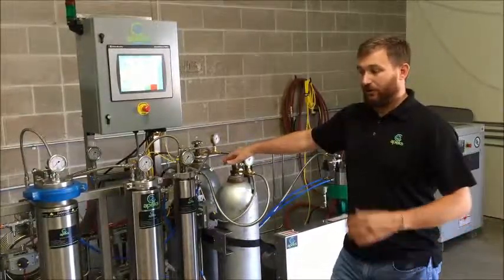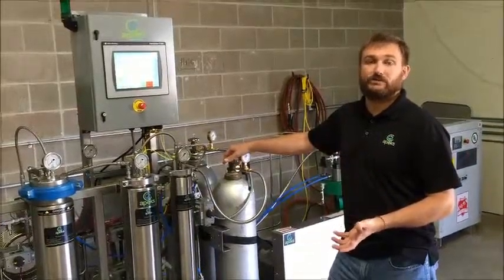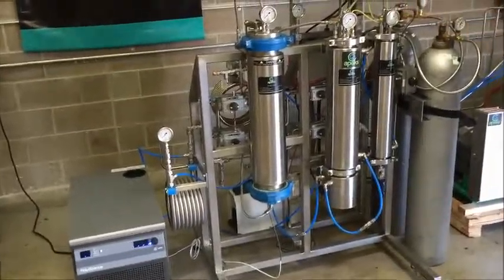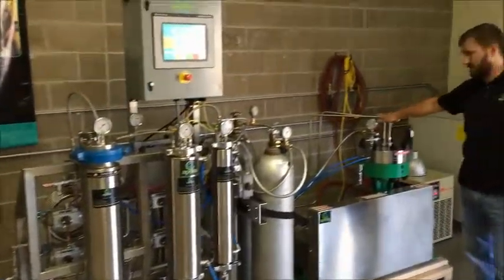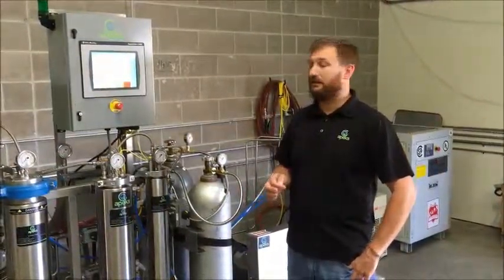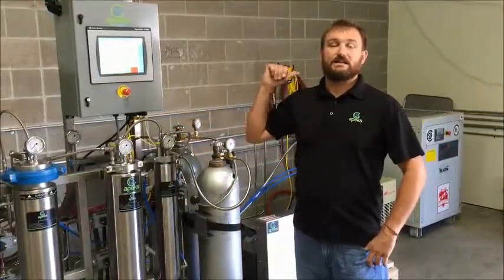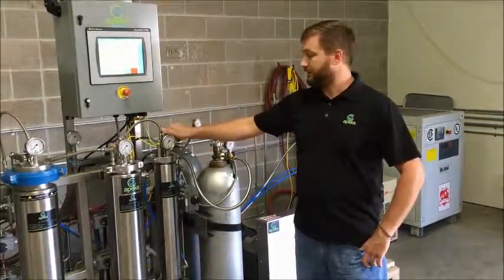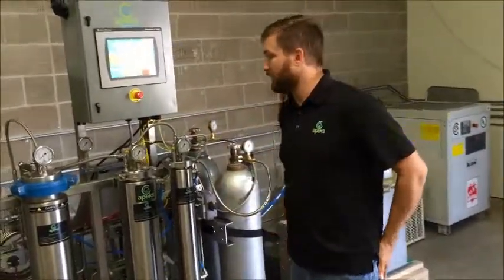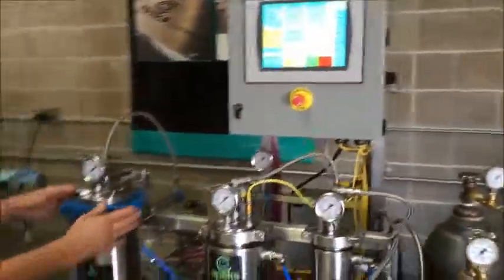Our 1,500 PSI 1-liter desktop system is all 110 single-phase electricity. Our 2,000 series systems have an option between single or three-phase electricity. If you choose the single-phase route, you have a 220-volt chiller, 110-volt system, and a 220-volt single-phase compressor. Our 5,000 PSI series are all three-phase — they require a 220-volt chiller, 110-volt system, and three-phase electricity for the large air compressor.